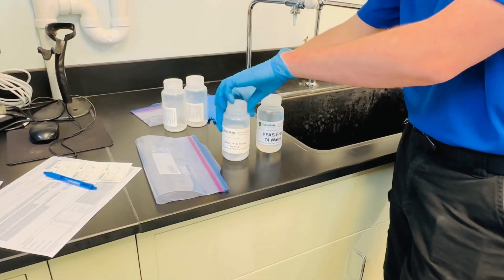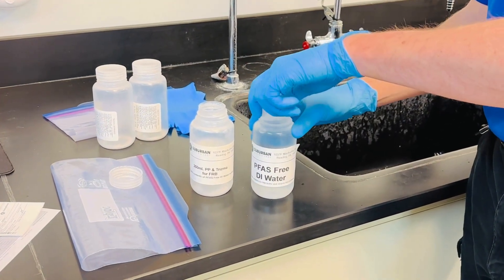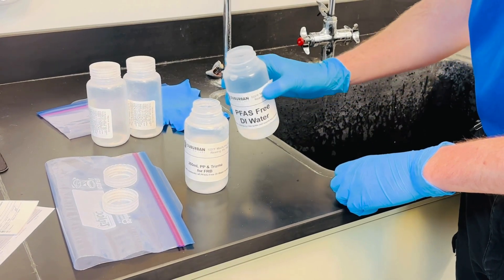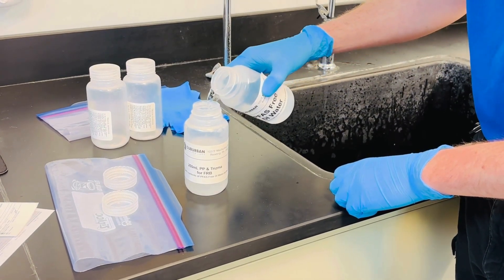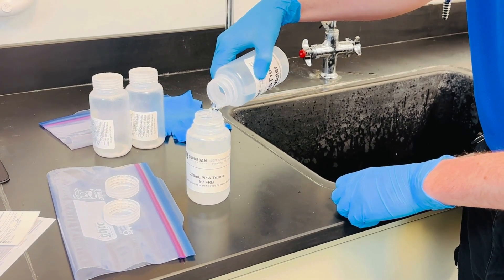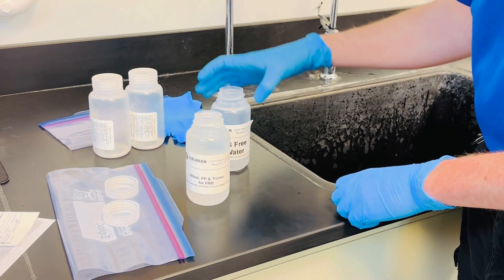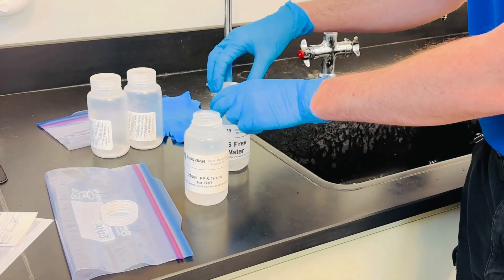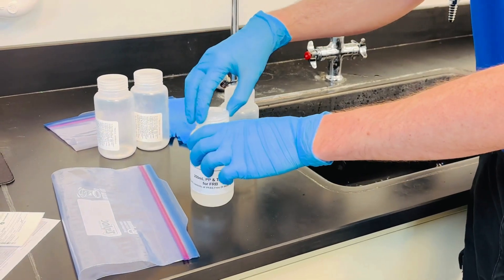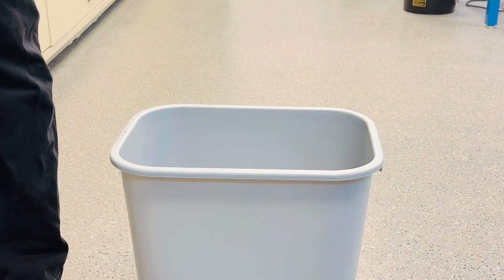Now it's time to start filling the bottles. Start with your field reagent blank — this must be done at the same time and place as your main samples are taken. Take the empty container labeled as the FRB and uncap. Take out the bottle labeled PFAS-free DI water and uncap. Pour the DI water into the FRB container. Cap the FRB bottle and bag it along with the sample bottles. The container label will read 'FRB hold' — make sure it is applied to the bottle for the FRB. Then recycle the empty bottle.